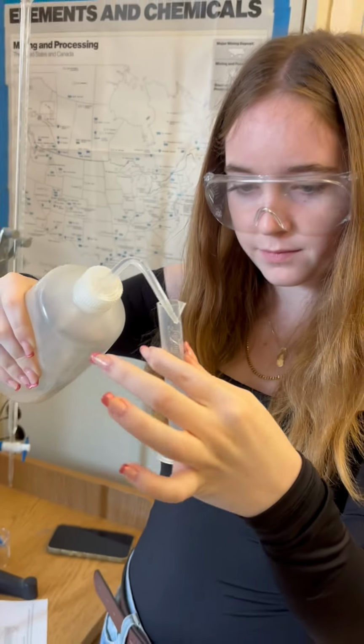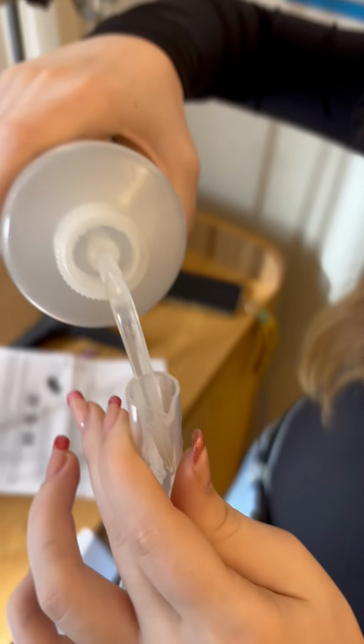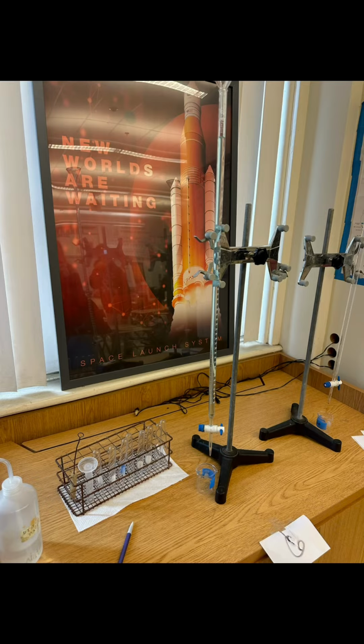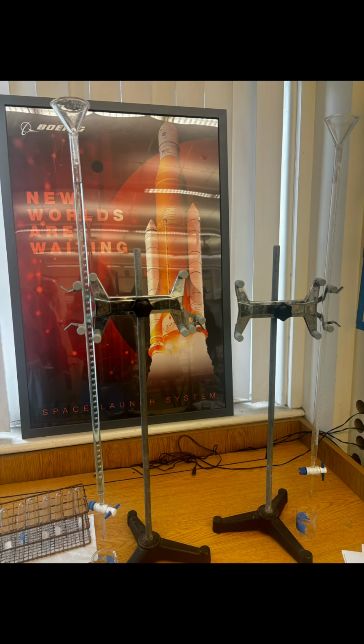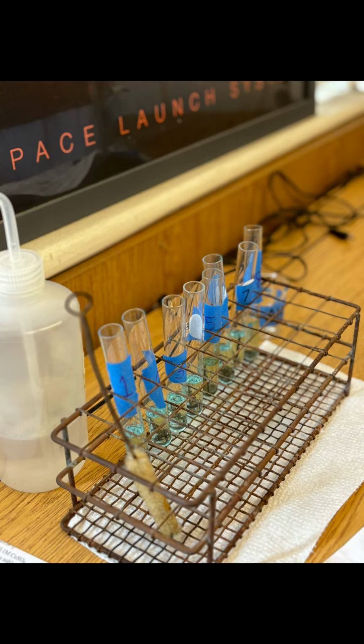For this lab, we started by sanitizing all of our materials by washing them out with municipal water, then with distilled water to get rid of all the unnecessary ions. This helped us get familiar with the equipment. The tools given out were 2 burettes, 2 burette stands, 2 burette clamps, 2 funnels, 8 test tubes, 2 beakers, distilled water, 1 drying rack, and 1 stirring rod.